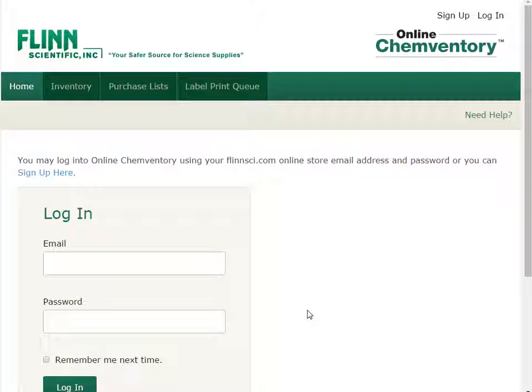Hi everybody, this is just a short little video to get you familiar with the Flinn Chemventory system. I sent everybody an email that had an invitation code and a link to the Chemventory system.